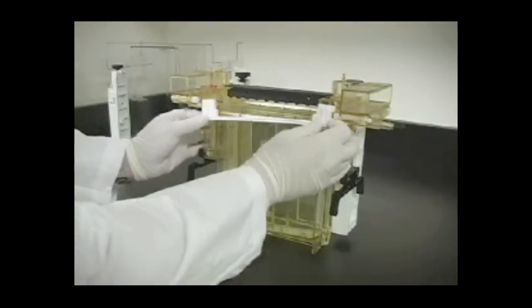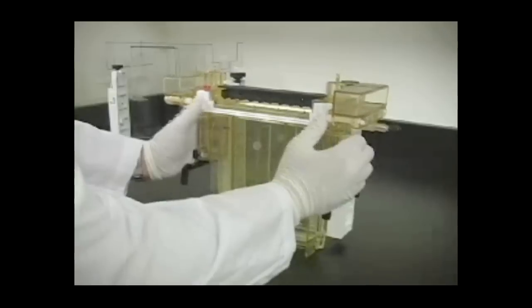Turn the cooling core over and repeat the prior steps to attach the second gel sandwich.